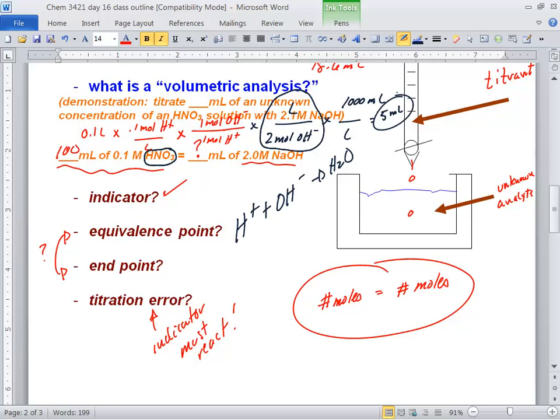There's about 3. Now I'm getting close. All right, and if you're in lab, you'd be a lot more careful, I guess. Do it drop-wise and not just drip it in there. And you need to stay there for like a minute or so.